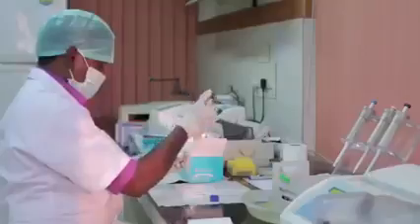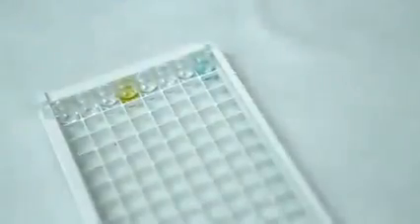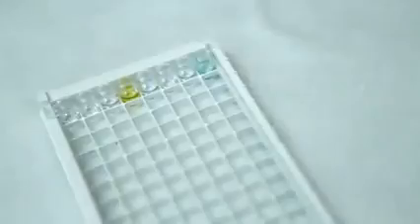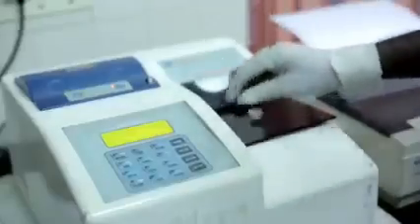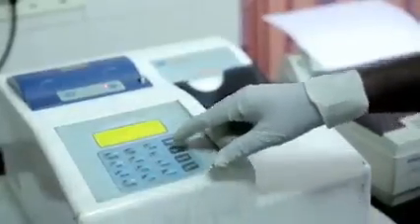Repeat the washing step. Meanwhile, prepare the enzyme substrate and keep it ready. Dry the microplate and add enzyme substrate to the wells as per instructions. Add stop solution to fix the color developed in the wells. Ensure that the blank well is negative. If not, the test is invalid. Results must be read immediately using the ELISA reader. A printout showing the absorbance values for the samples in the microplate is obtained.